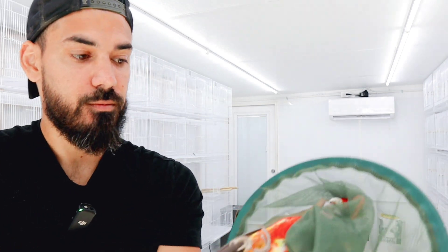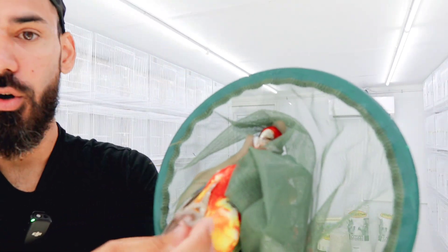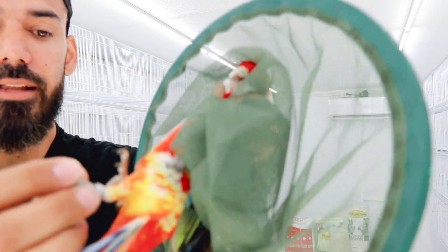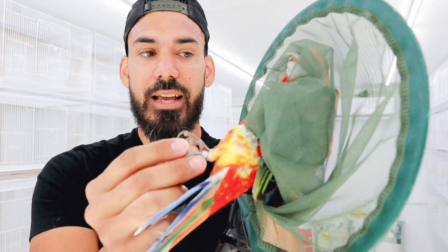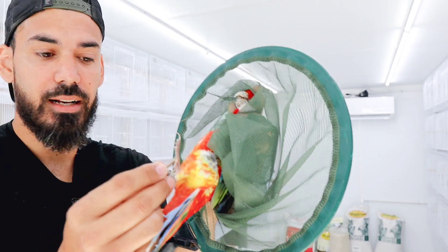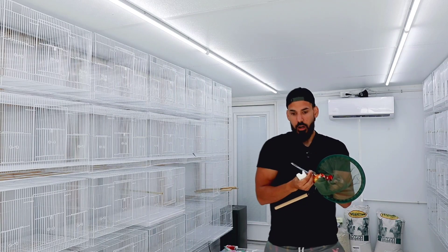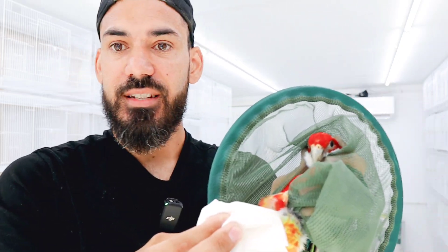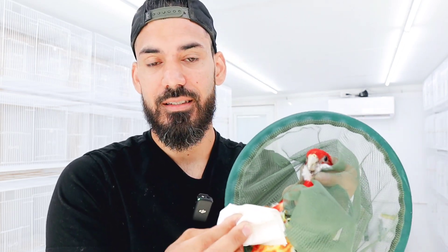You have easy access to their toes. One of the things you'll need to fill out the card is their band number and identification information — I'll show that later. Let's go ahead and clip the toenail. We clipped the nail and applied the wound gel to stop the bleeding. Then use a swab, cloth, bounty, or whatever, and hold the wound for a good 10–15–20 seconds until it seals up. Then you can go ahead and put the bird back in the cage.